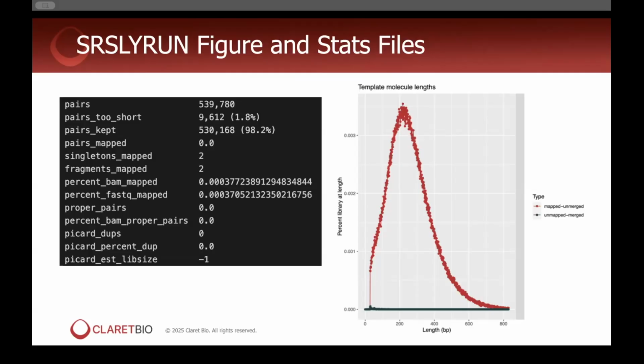This can be helpful too if you expect to see something at a certain length and you're seeing in this result that it's not quite the same. That's always a good way to understand how successfully your library was run through the sample, and to give yourself a good idea about how well you ran it, and if there could be adjustments, like maybe this wasn't the right reference file to use because things aren't looking as I expect. Then you can always rerun based on how you've recognized the results to be.